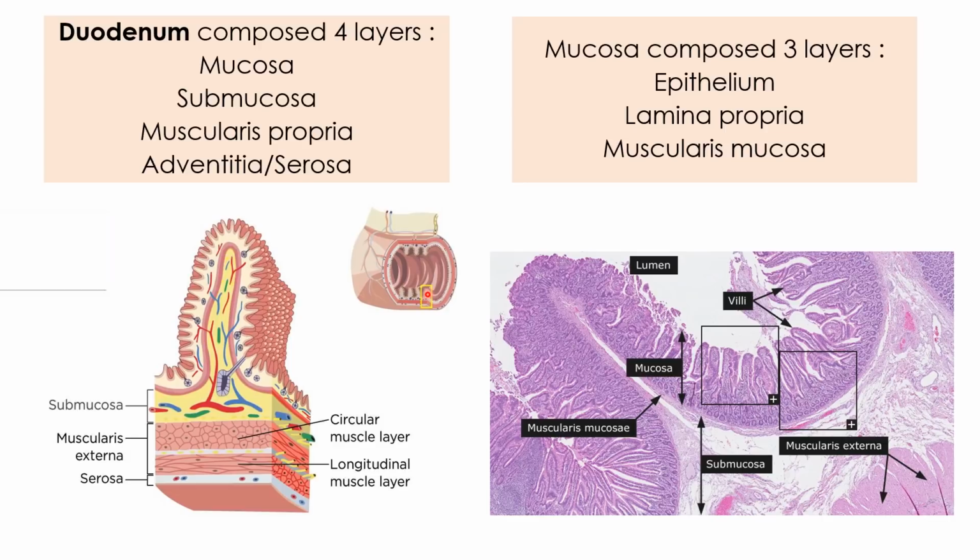plica circularis. You can see in this picture it's C shape. So this is the plica. Here you can see a smaller structure, isn't it? Something like this. So this is the villi.